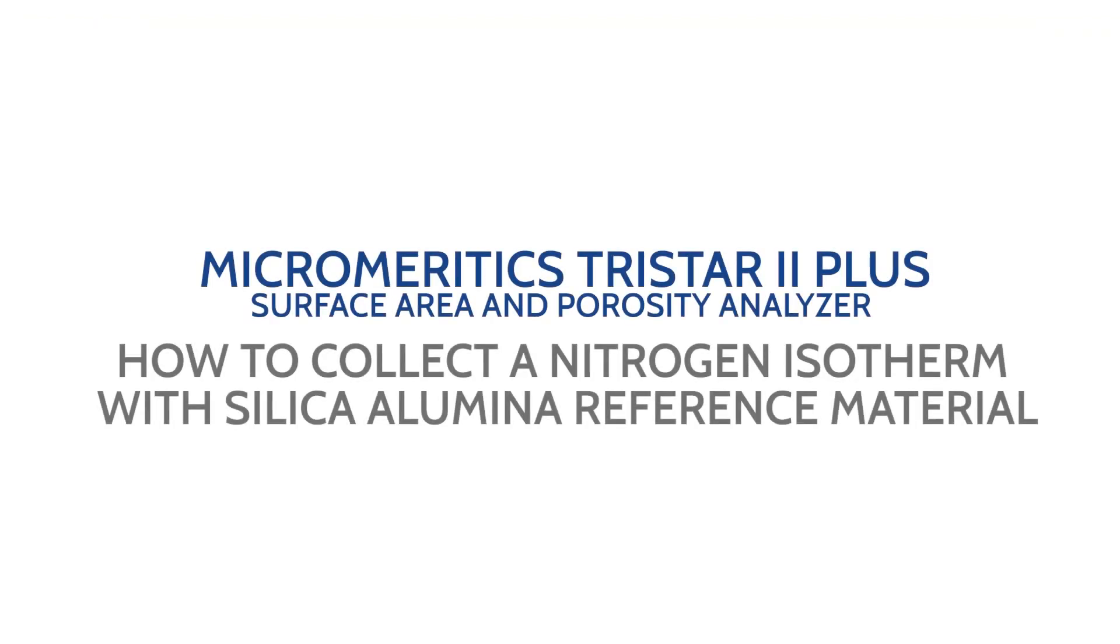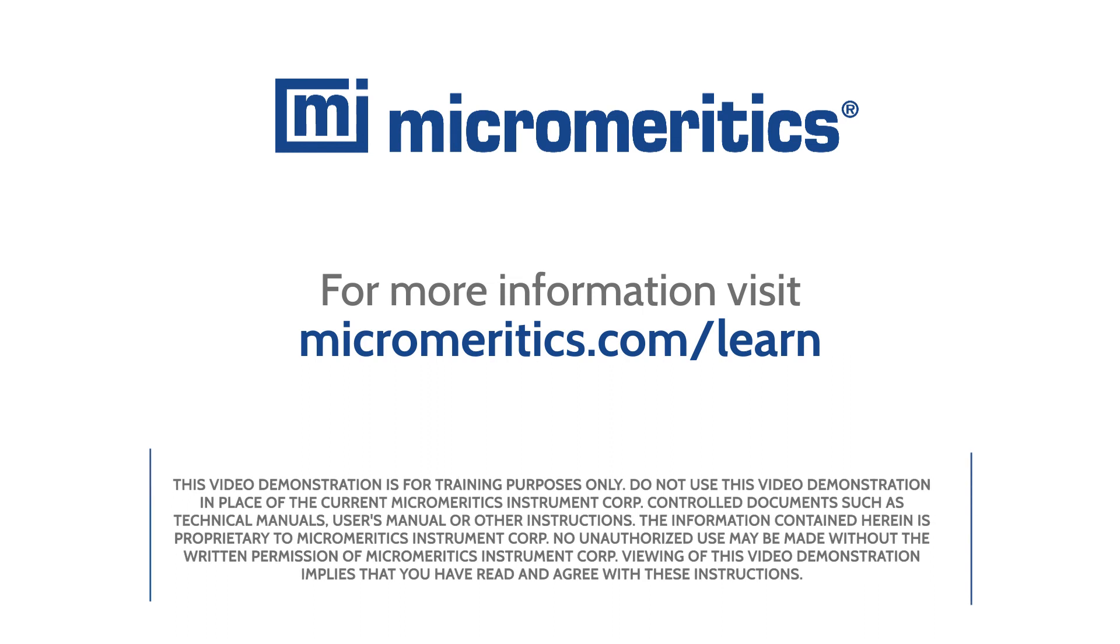Now you are ready to collect a full nitrogen isotherm on the Micromeritics TriStar 2 Plus Surface Area and Porosity Analyzer. For more information, visit micromeritics.com/learn.